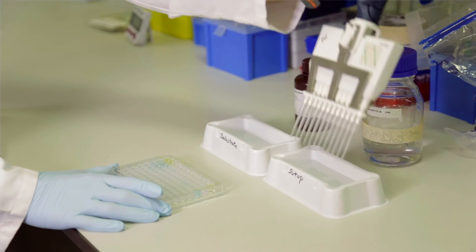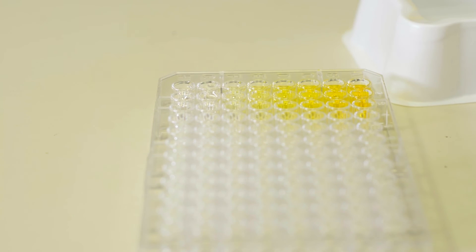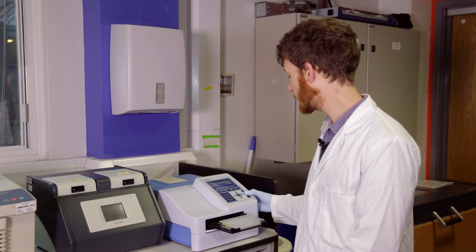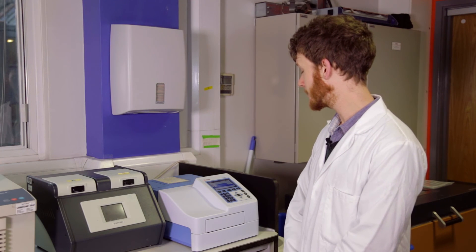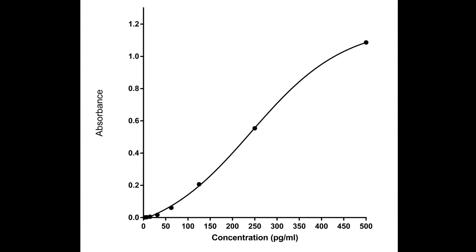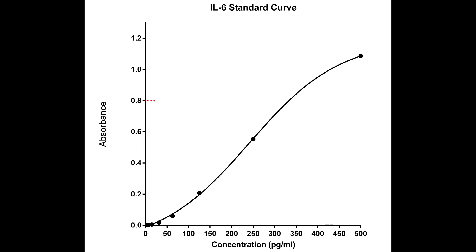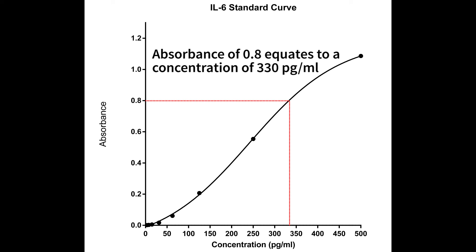The enzymatic reaction is stopped by the addition of an acidic stop solution to each well of our plate. This will cause a colour change from blue to yellow, and it is the intensity of this yellow colour which will allow us to quantify the amount of target antigen present in each well. We are able to measure the intensity of this colour change using a photometer specifically designed for 96-well plates, often simply called a plate reader. Using the light absorbance values produced in each well for our samples, we can calculate the concentration of interleukin-6 by comparison to the absorbance values produced by our standards. This is done by plotting the absorbance values for our standards on one axis against their known concentrations on another, and plotting a line of best fit. We can then find the concentration of interleukin-6 in our samples by plotting the point of intersection from its known absorbance value to its corresponding concentration value on our graph, provided this absorbance value falls within the range of our standards.